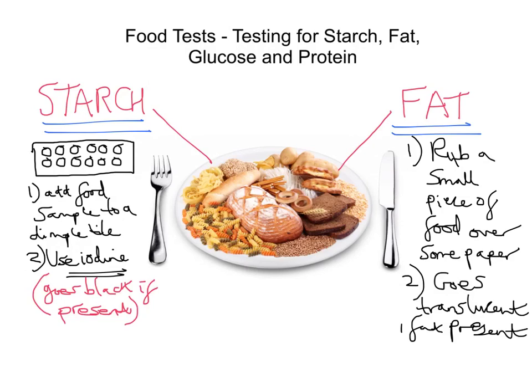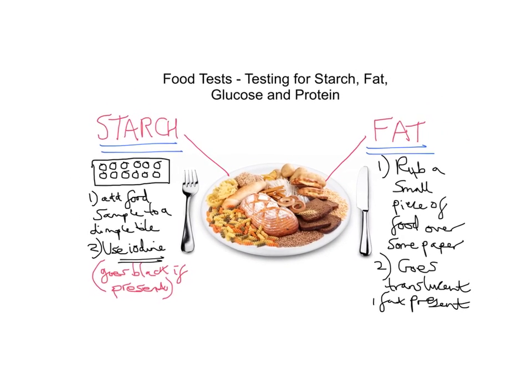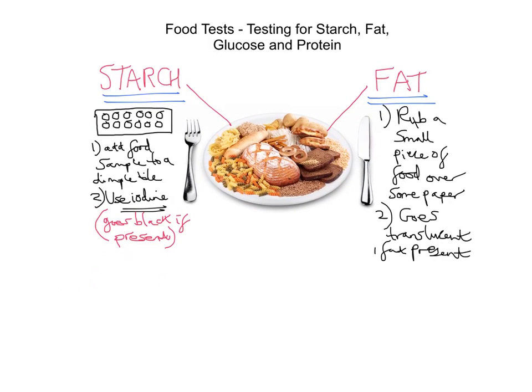So we've done starch, we've done fat. Let's look at the two big ones, glucose and protein. So for this we're going to shrink the screen just a little bit. So now we're testing for glucose.